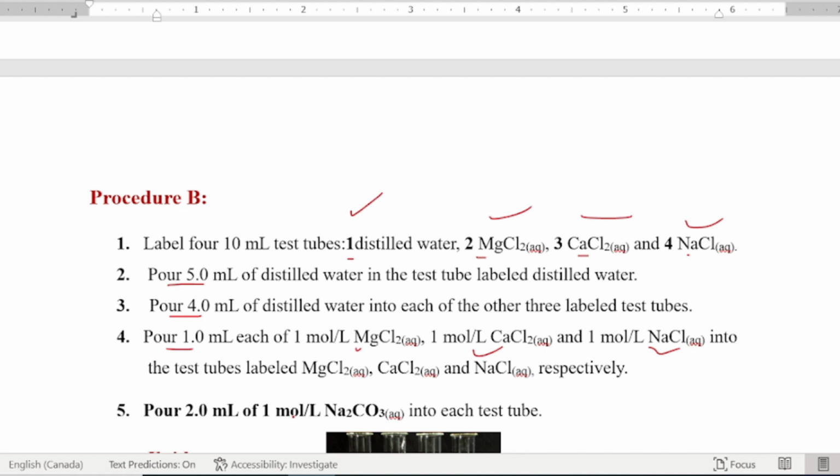We are putting sodium carbonate solution into that. Okay, 2 milliliters of sodium carbonate into each of these 4 test tubes here. Anybody want to make a prediction as to what they will see? Do you remember something about when we want to soften hard water?